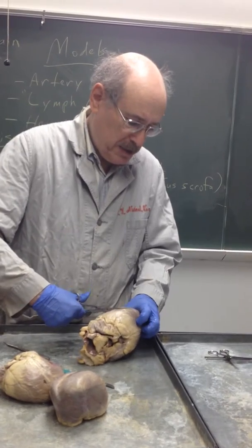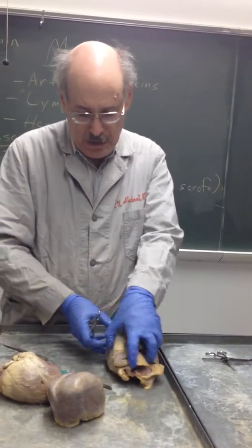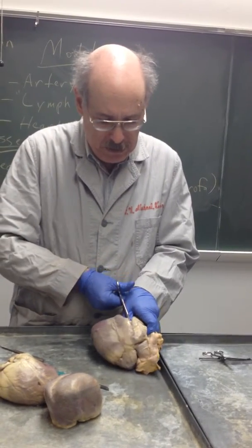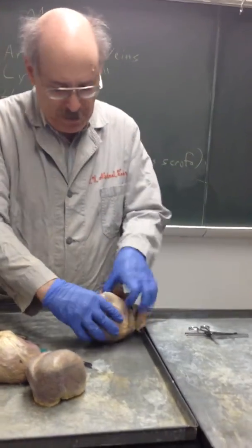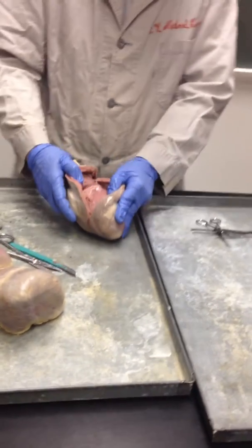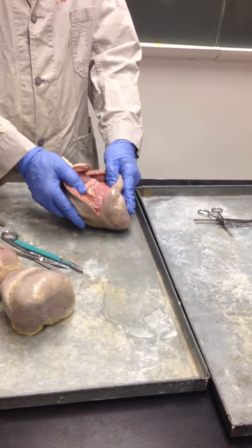So I'm following the incision line with the scissors, and also running upwards to cut the pulmonary trunk lengthwise. And here we have a nice exposure of the endocardium. As it's a bright pink color, this pig had a nice healthy endocardium.